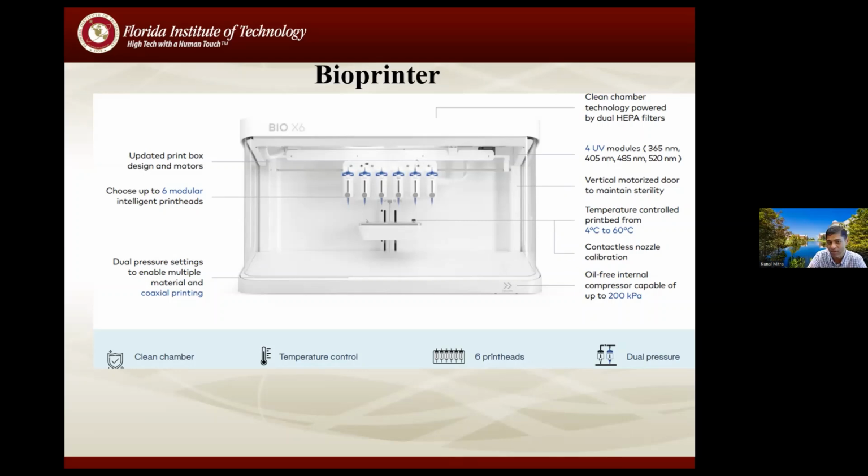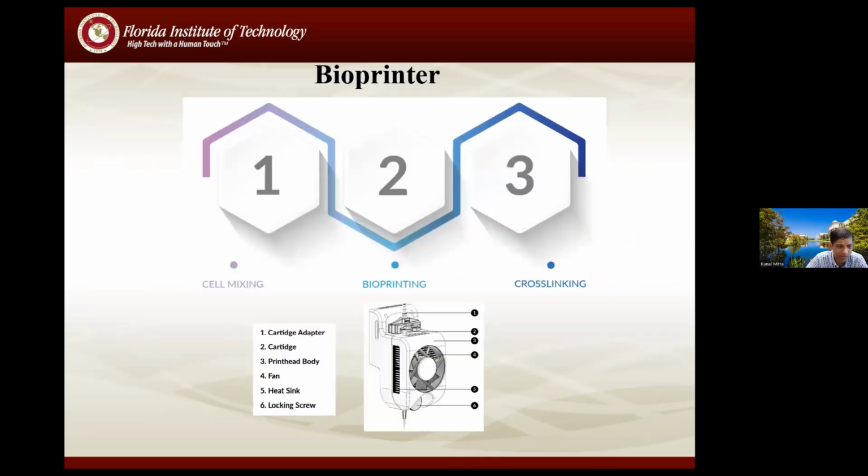So these characteristics have to be really well controlled, and that's why you could see that the print head and bed temperatures can range quite high. I mean, you definitely never go to 60 degrees, but it has the potential. But typically, with our controls, we have anywhere from 10 degrees to 25, 30 degrees based on what type of biomaterials we are using. So it's a lot of controls and optimization of the pressures involved in this 6-head bioprinting process.